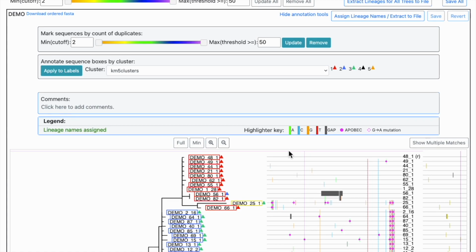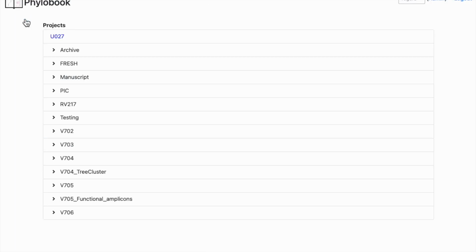Similarly, there's a bar up here that I can drag down, and this will allow me to more easily correlate data within a match plot, mismatch, or a match plot with a very specific sequence because it highlights all the way across. Alright, so there are some other tools that are available to us that aren't particularly applicable to this data set, so I'm going to stop for a second and then we're going to pull up a different data set. So now I'm going to go back into my projects.